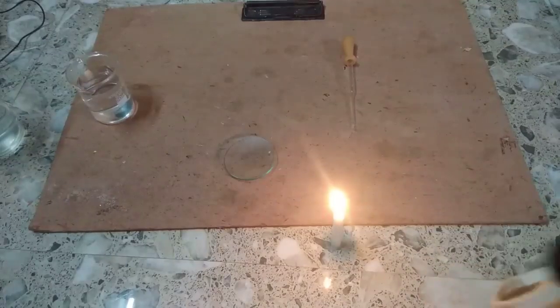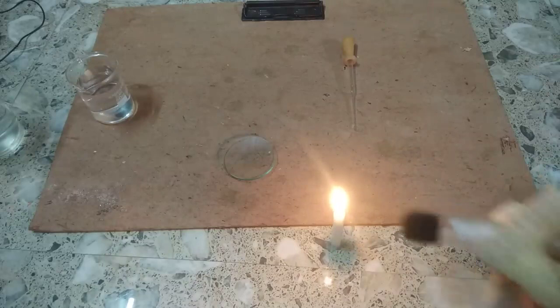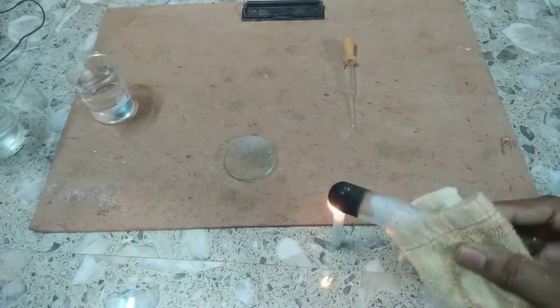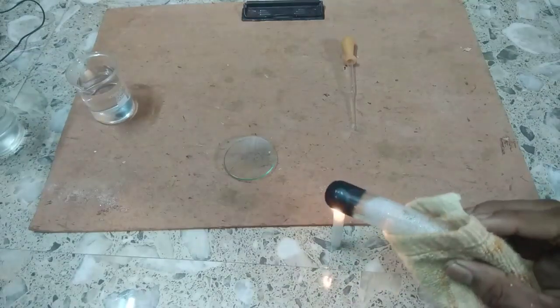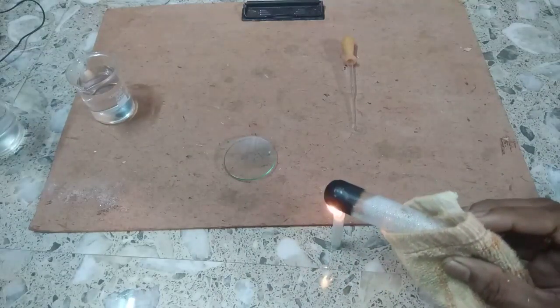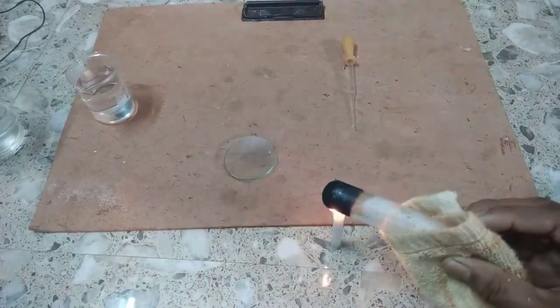Right? And we'll take this in a watch glass and see what is the color of this copper sulfate. Let us heat it first.